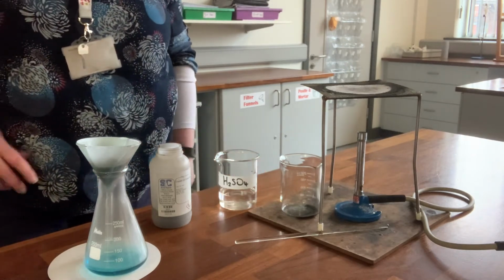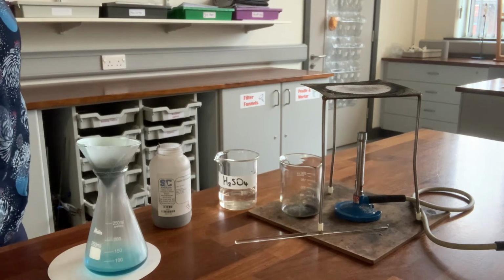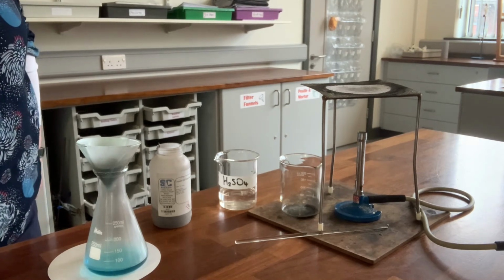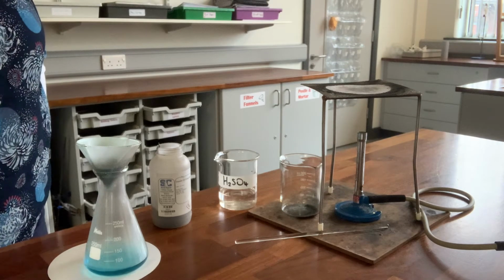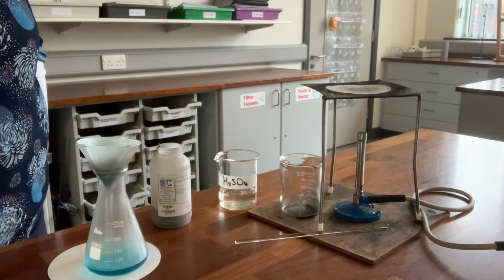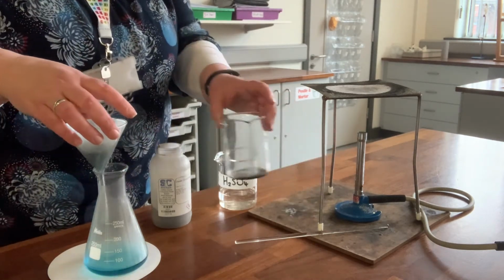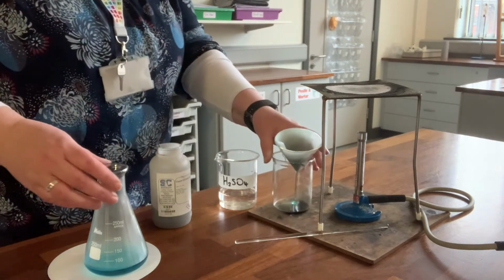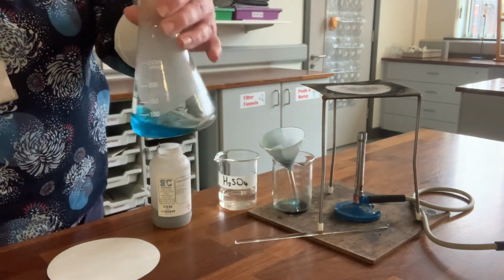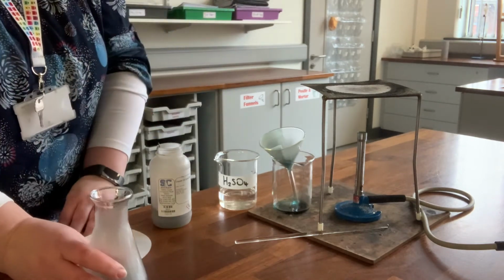Now at the end of this experiment, what we might want to do is to try to separate the copper sulfate from the water, just to get the copper sulfate crystals. You maybe remember doing this in key stage 3. What we're going to do is just to evaporate off the water, and we'll be left with the copper sulfate crystals. This is a process that's called crystallization. So we take the copper sulfate solution from our flask and we pour it into an evaporating basin.